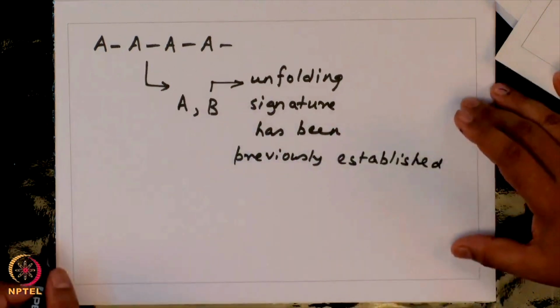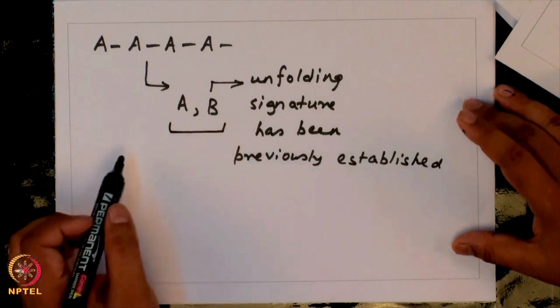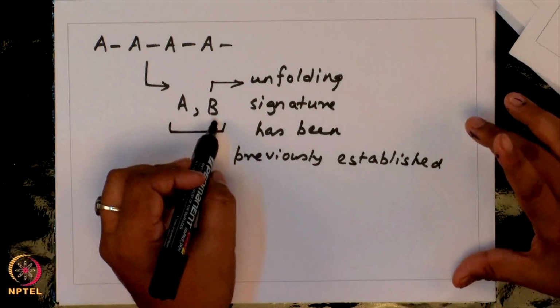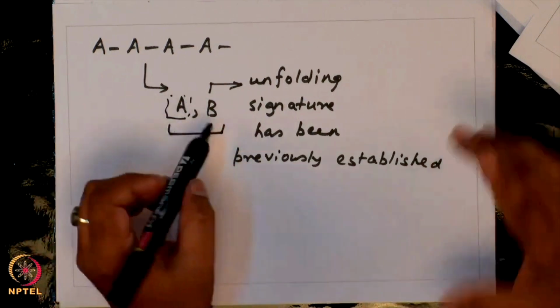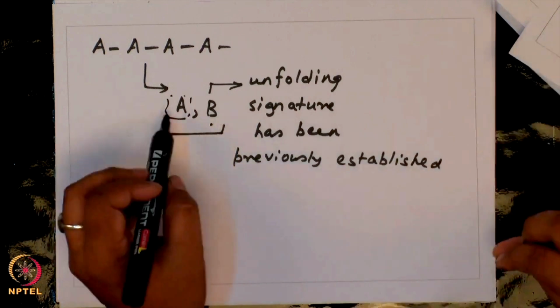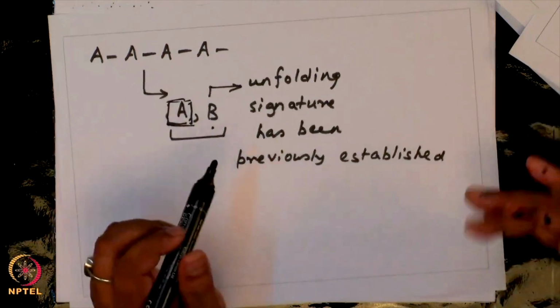The rationale being that if you are doing your experiment, because B has an unfolding signature, even if you do not get A, you know that your B signal should always appear in your protein unfolding signature. So, in that case you can say that probably A has very low unfolding forces, that is why we cannot detect it. Okay. So that is one possibility.